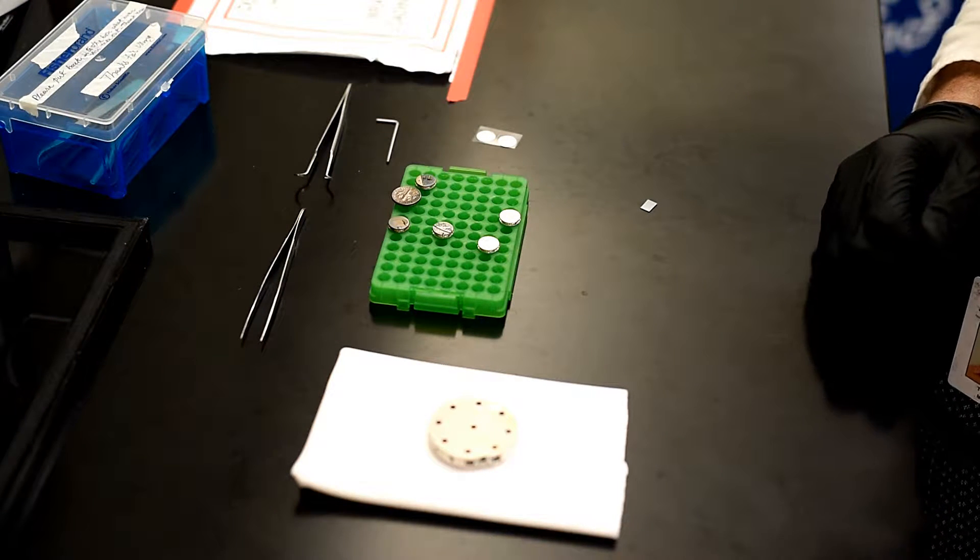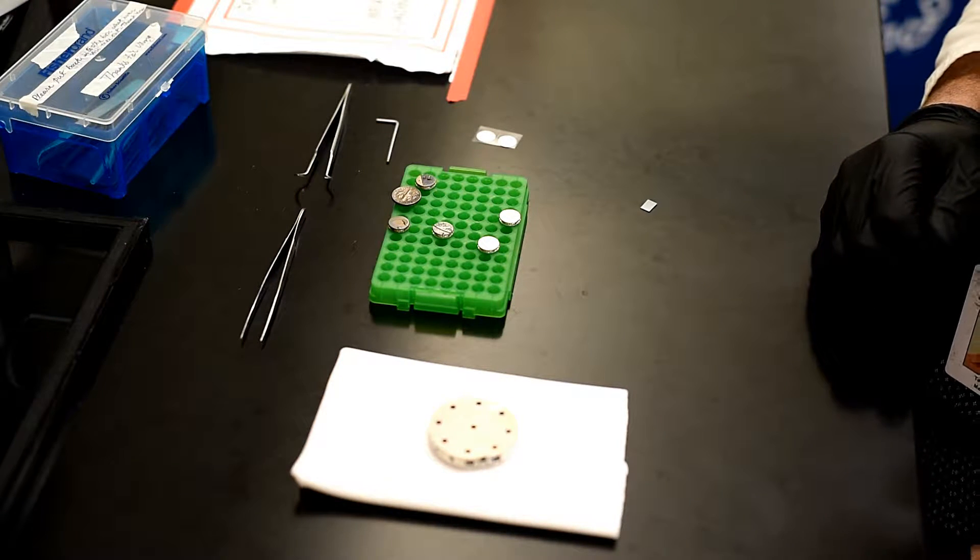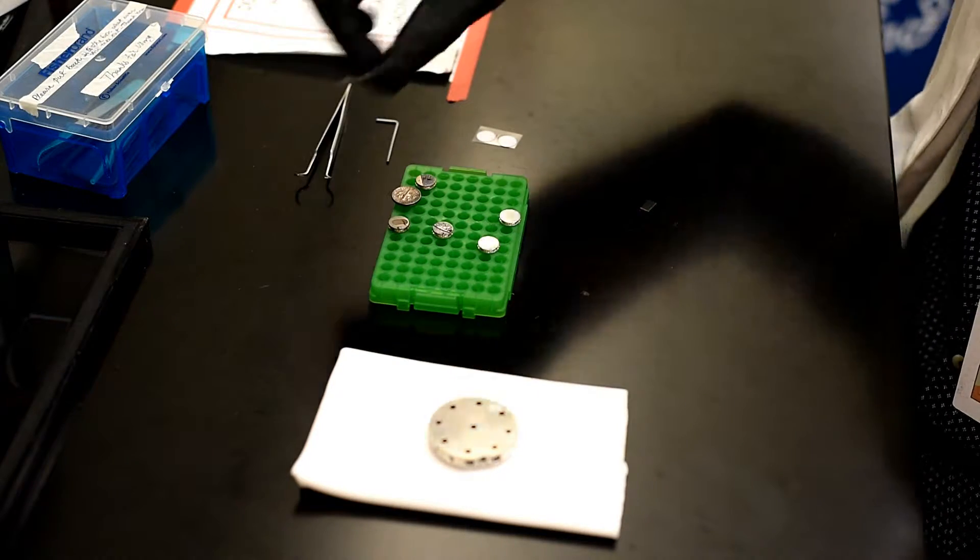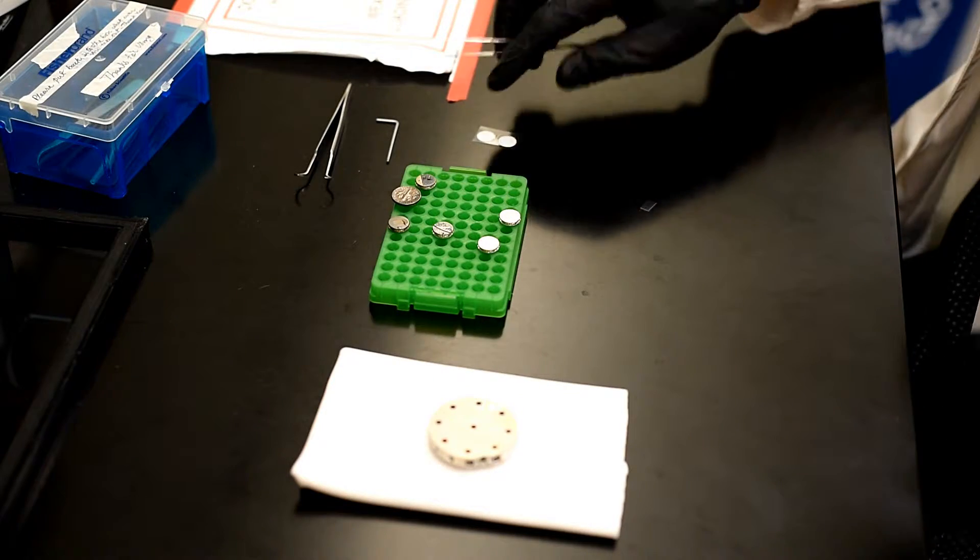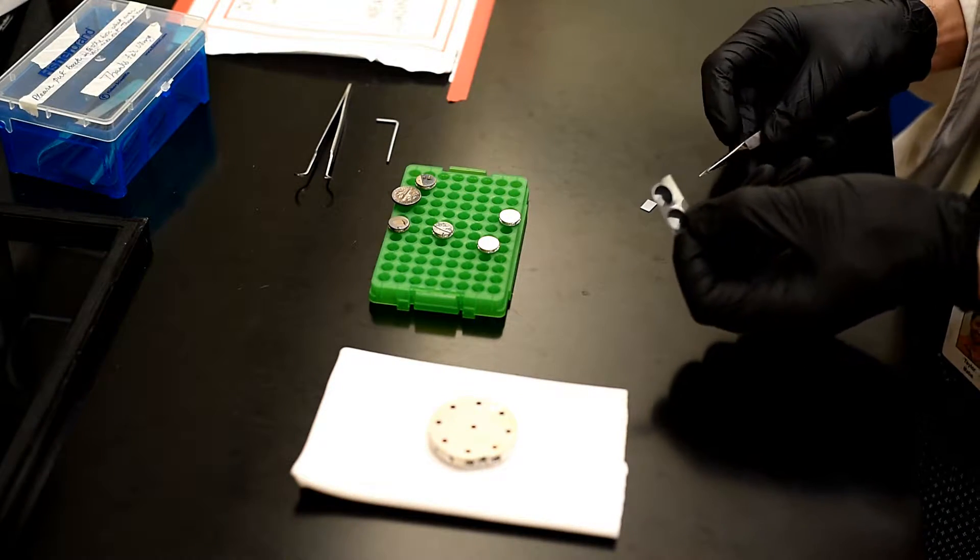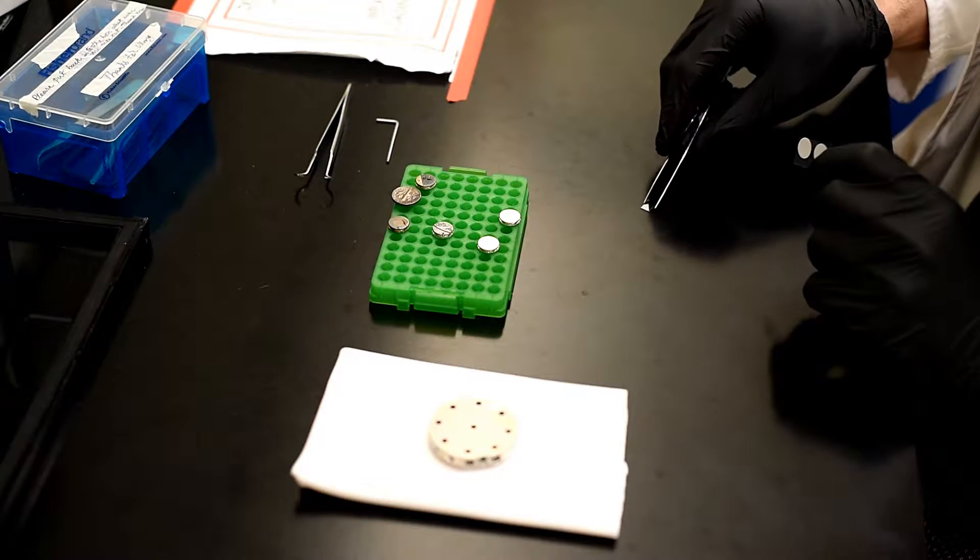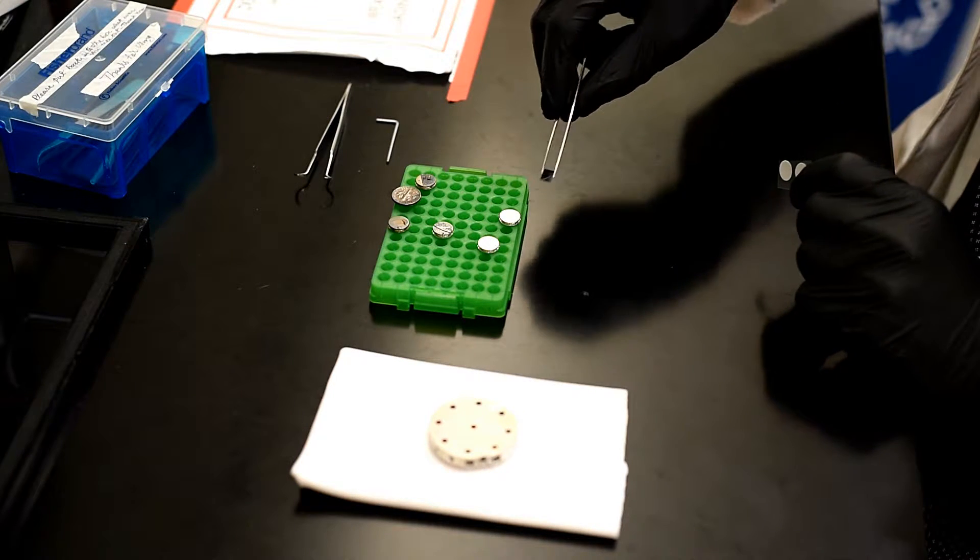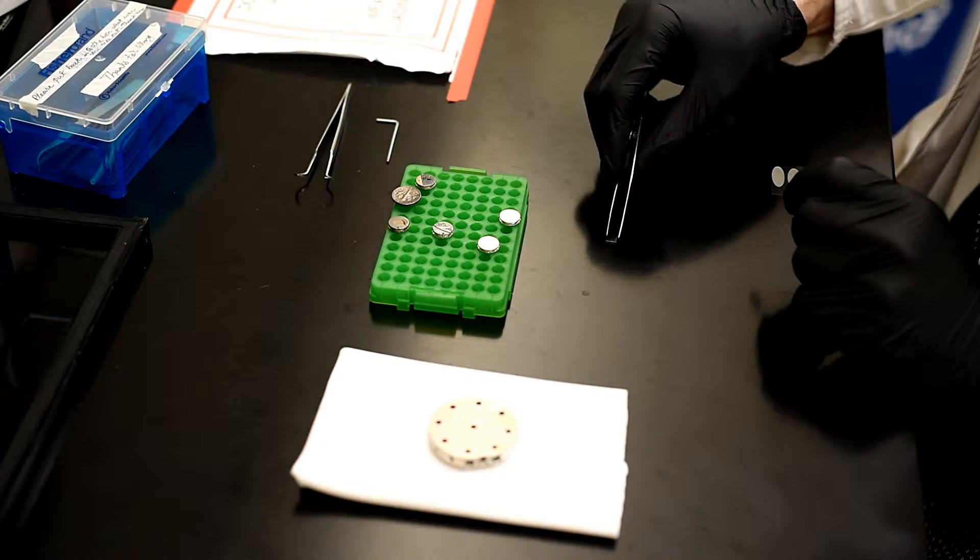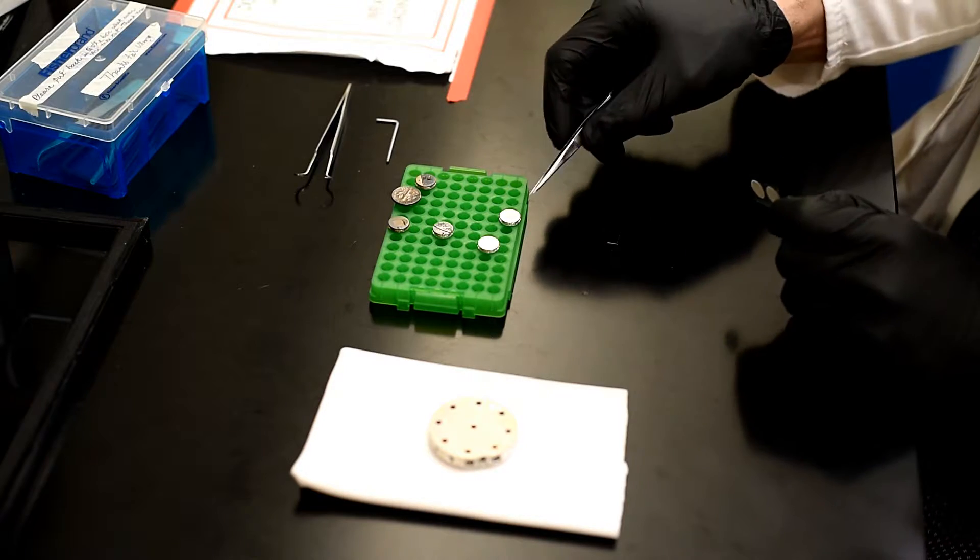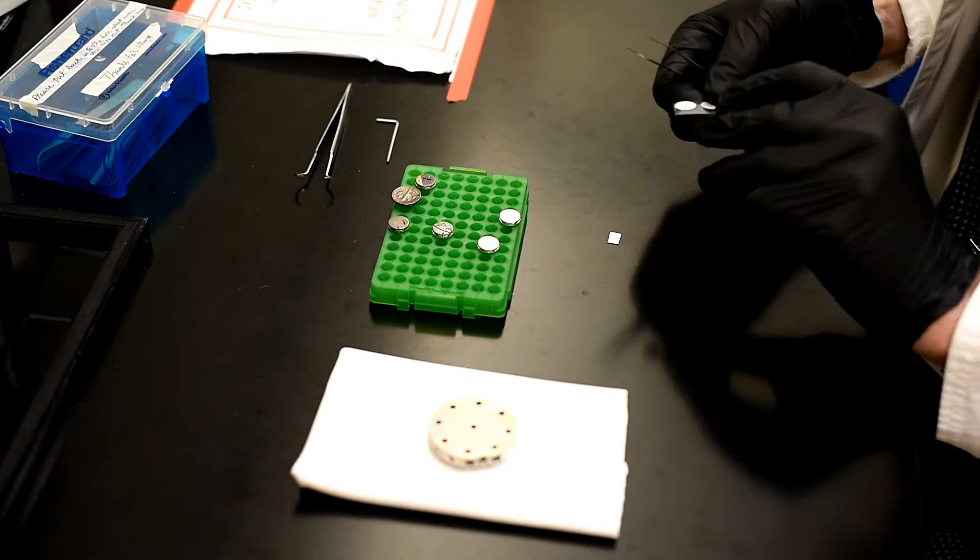But if you wanted to load a sample, you could use the silver glue or double-sided carbon tape like this. And I've just got just a piece of silicon that I'm going to put on the stub. So this is the sample holder and this is the stub.